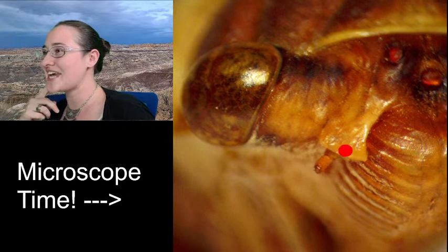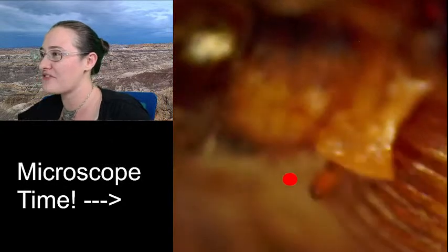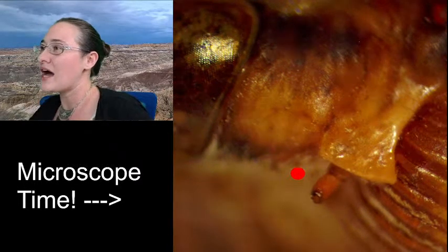So the antenna is pretty much this one to two segmented, and it's very, very short up here in the front of their head. And that's pretty much why we can't see it from the dorsal, so we can't see it from the top.